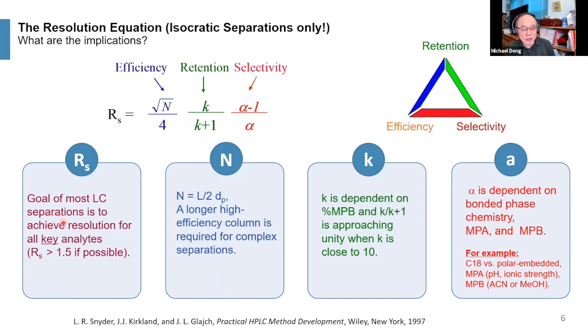Now here I want to define the goal of most LC separation. The goal of most LC separation is to achieve resolution for all key analytes. Now here is the caveat. Here is an important thing. It's called the key analyte. What is a key analyte?